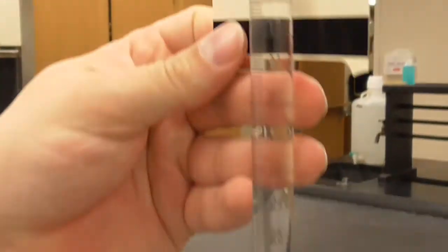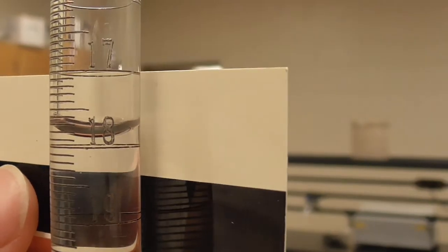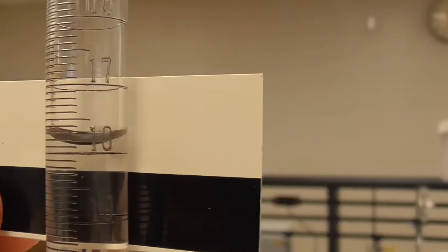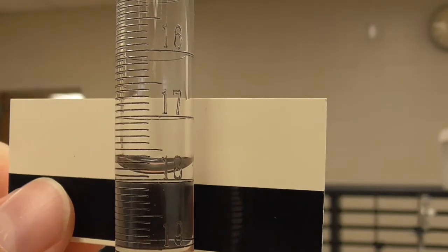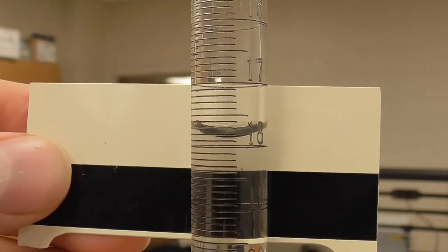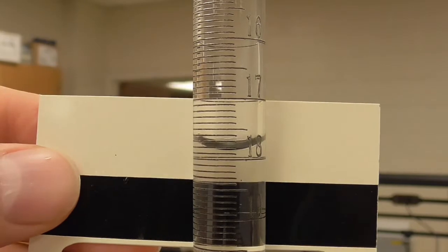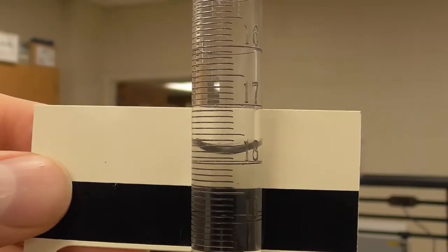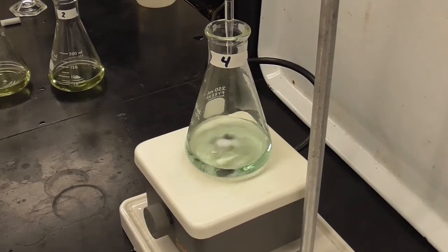So we'll come in here and let's see. I don't know if you can quite read that. Okay, there's the ending point. There, now we got it. There's the ending point for the third sample. Okay, so this is the starting point for sample 4, but if you didn't catch it earlier, this is also the ending point for sample 3. So again, I'm going to pause so that we can go ahead and do the titration.